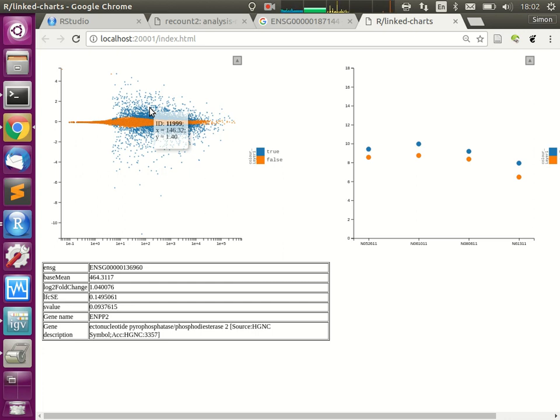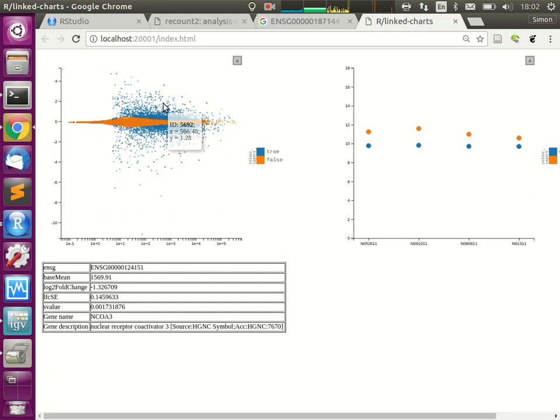Or maybe you have some specialized tool, some RNA-seq explorer thingy that somebody has written his master thesis on, which allows you to look into the data like this, specifically for one data set. And what we are now working on is to give you the tools to be able, within R, to just quickly put together something like this.